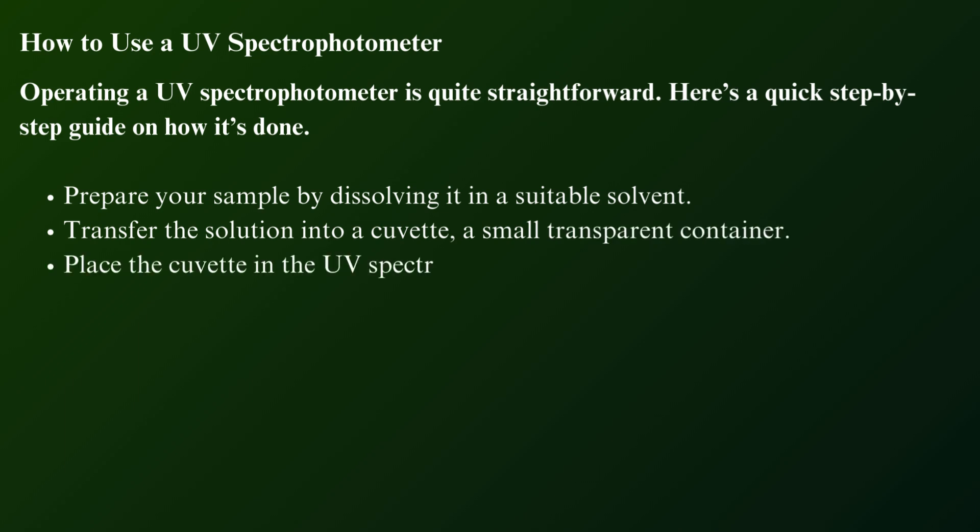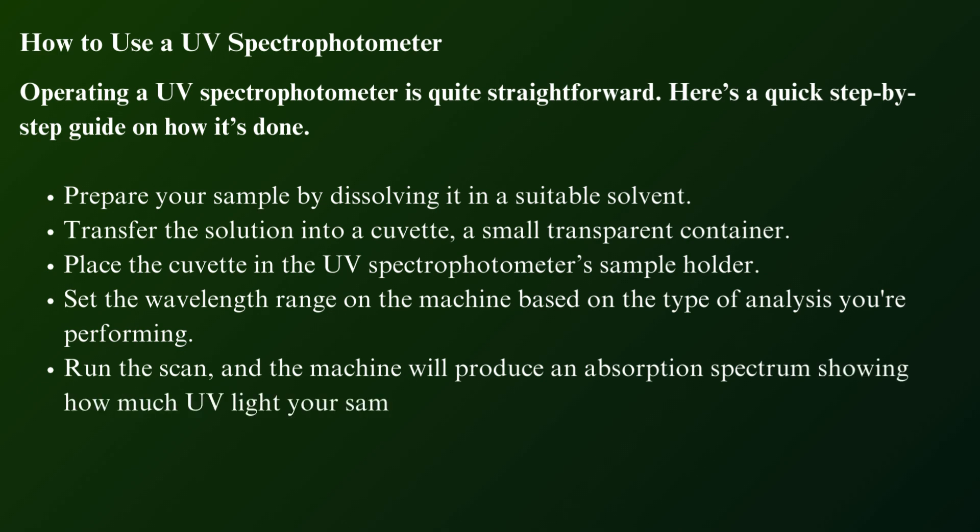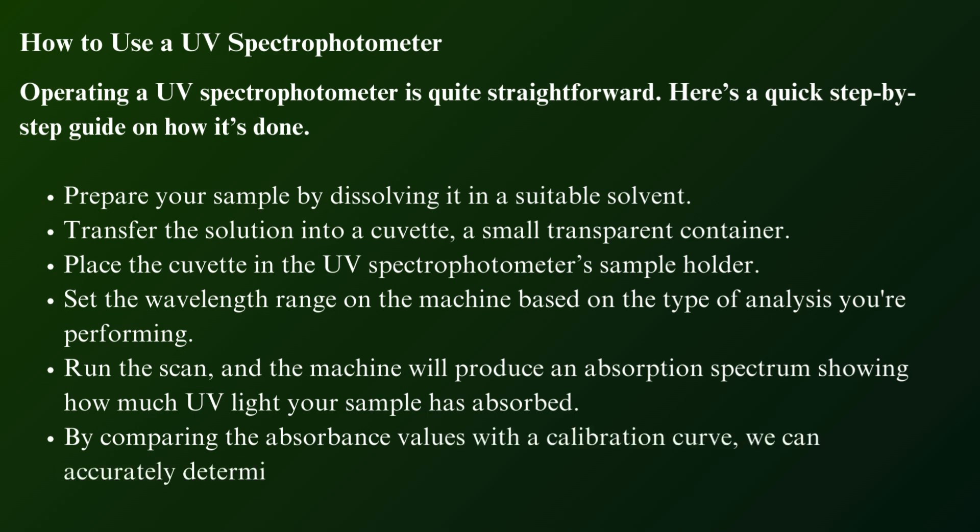Place the cuvette in the UV spectrophotometer's sample holder. Set the wavelength range on the machine based on the type of analysis you're performing. Run the scan, and the machine will produce an absorption spectrum showing how much UV light your sample has absorbed. By comparing the absorbance values with a calibration curve, we can accurately determine the concentration of the sample.